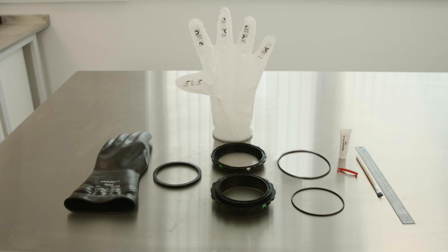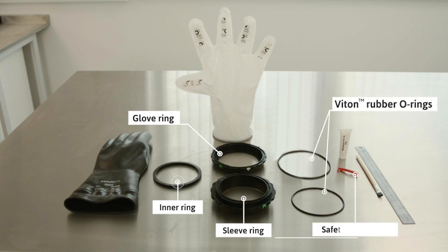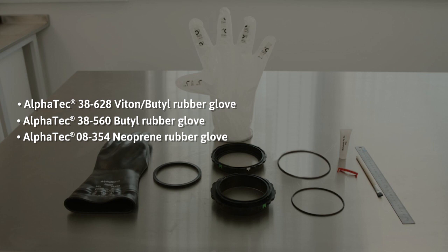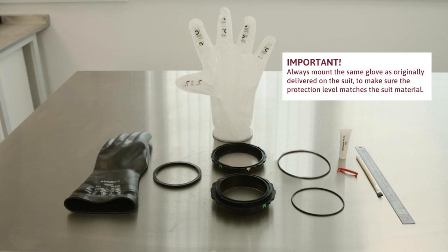The Alpha Tech bayonet ring system consists of the following parts: sleeve ring, glove ring, inner ring, Viton rubber O-rings, and safety locking pin. The following gloves can be mounted in the Alpha Tech bayonet glove ring: Alpha Tech 38 628 Viton butyl rubber glove, Alpha Tech 38 560 butyl rubber glove, Alpha Tech 08354 neoprene rubber glove, Alpha Tech 0 to 100 barrier glove welded on ring, and Alpha Tech rubber cuff.